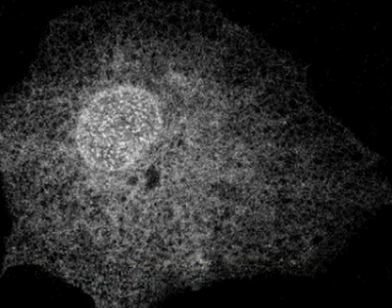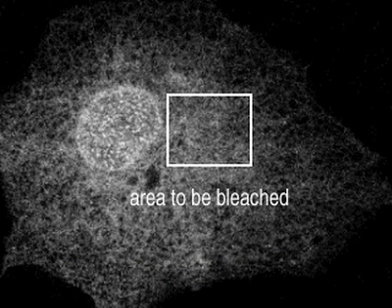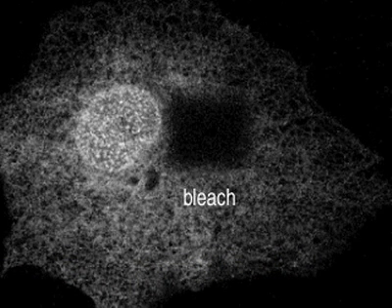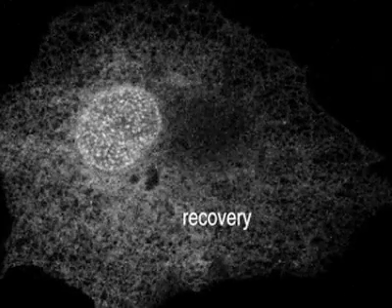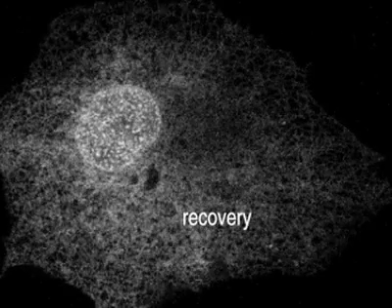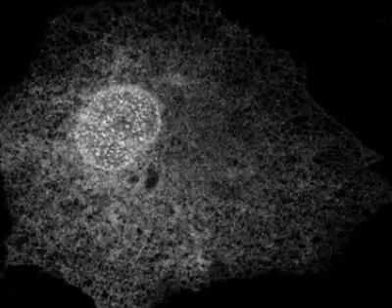Here, GFP is fused to a membrane protein that lies in the membrane network of the endoplasmic reticulum. After bleaching, we observe quick recovery of the fluorescence, showing that the protein is very mobile in the plane of the membrane.